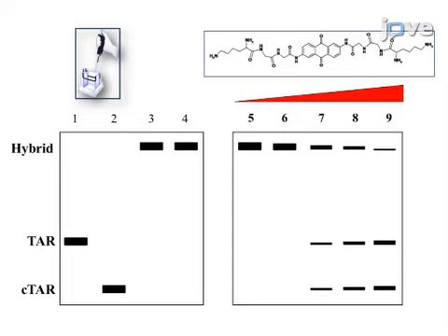The main advantage of this technique over existing protocols such as gel shift analysis or TAR annealing is that it does not require preliminary manipulation of nucleic acids such as radioactive labeling. This method can help answer key questions in the field of drug discovery, such as HIV-1 NC inhibitors.